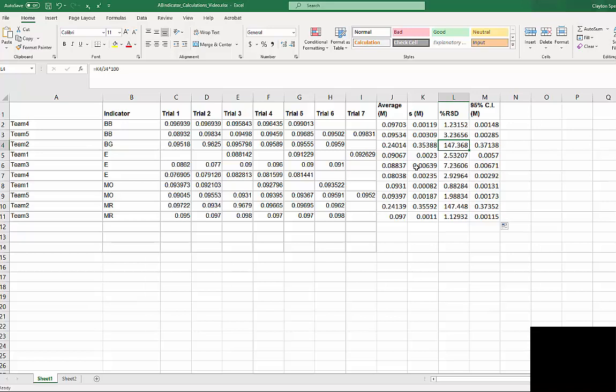All right, so let's take a look at some of our numbers here. So percent relative standard deviation, that gives you a good idea of by how much the data vary from each other. So you see that at best was this set of data down here where you have a standard deviation about 0.8%, 0.9%. So that's really pretty good. We might hope to get all the way down to about 1/10% or 0.2% relative standard deviation if we were really good titrators. But this 0.9 here is not terrible.